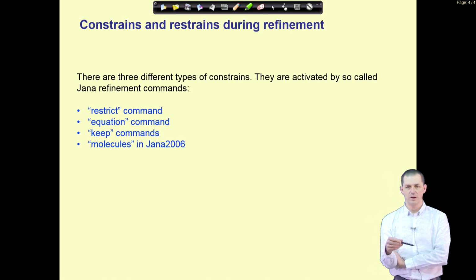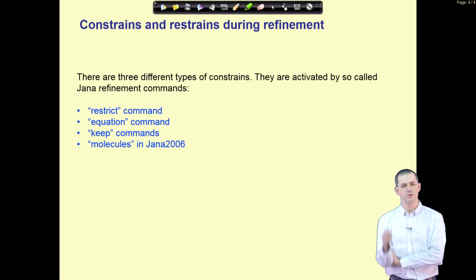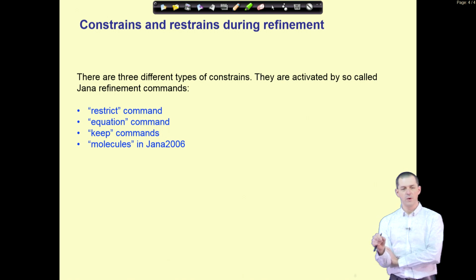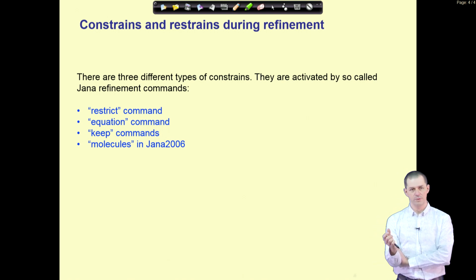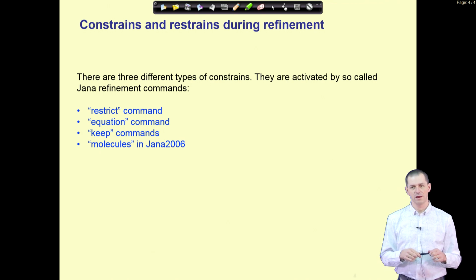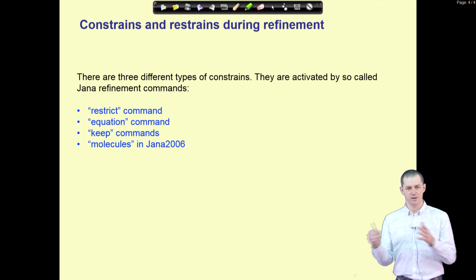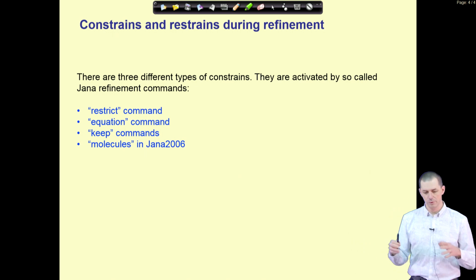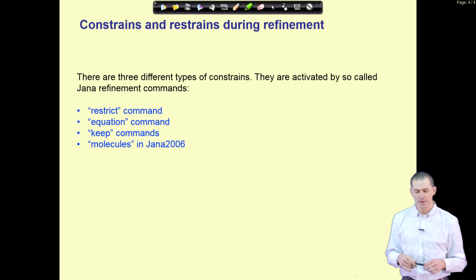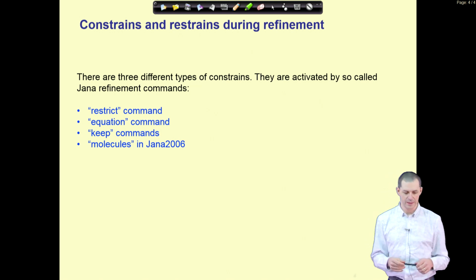And one reason why it is so easy and flexible in Jana is that Jana does not internally use any tables for space groups. Everything is done using linear algebra, so any setting of space group is possible, any group-subgroup relation is possible. There is nothing like a non-standard setting that Jana could not work with. So therefore also the symmetry transformations are possible in a very general manner.